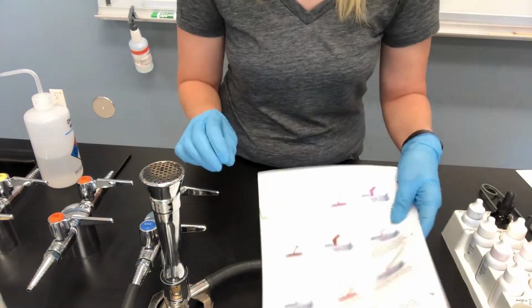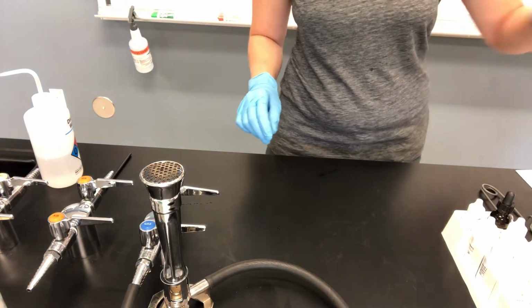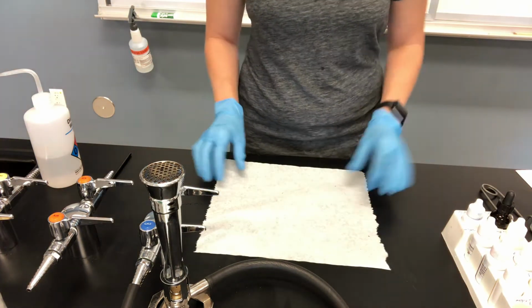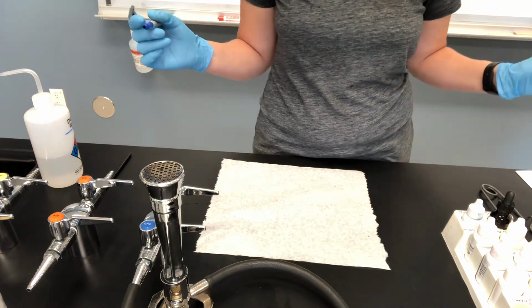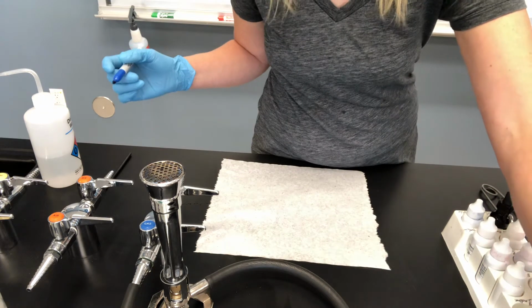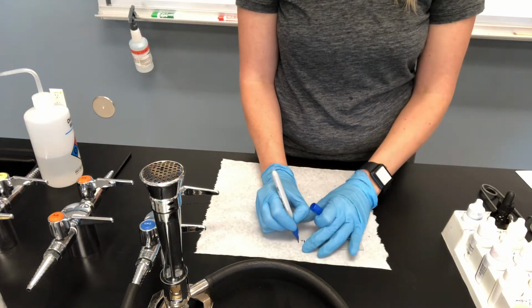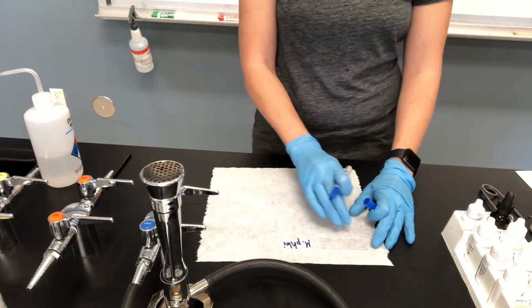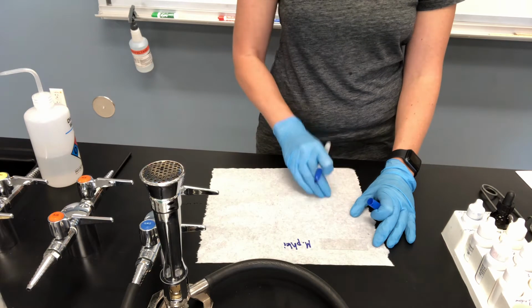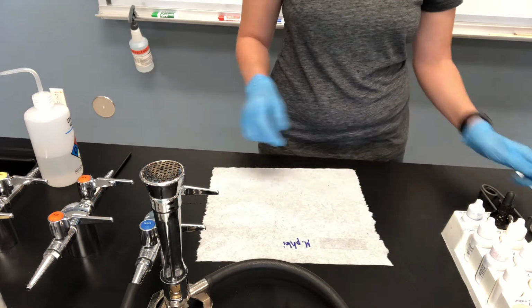It's going to start off very similar to your simple stain in that you have to make a smear. So again, I'm going to start off with my paper towel organization, my clean slide. I had a clean slide already. I just have my one organism still. I'm still working with Mycobacterium phlei. But when you are in lab doing the gram stain, you're going to do 3 of these. So that's why this paper towel organization is going to be really helpful for you.